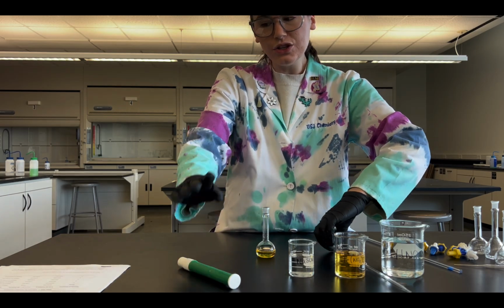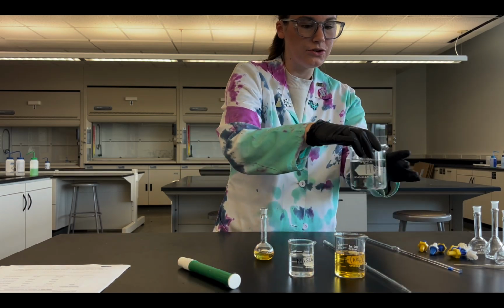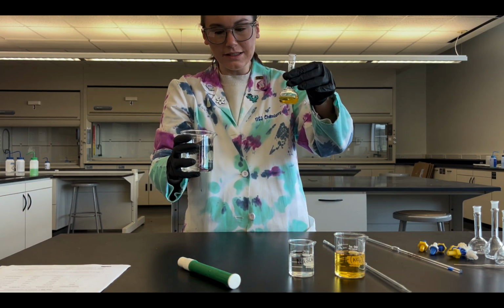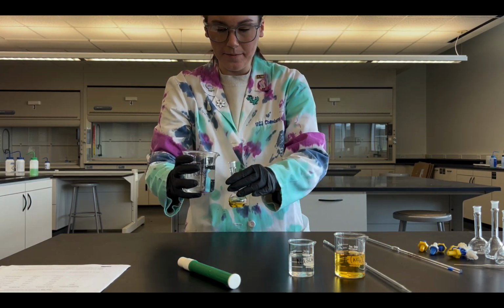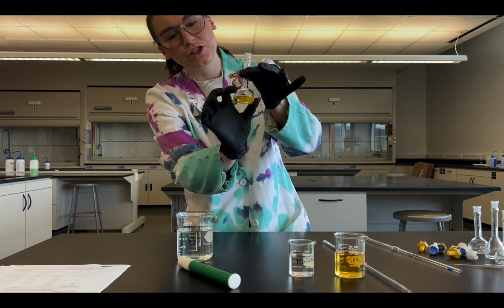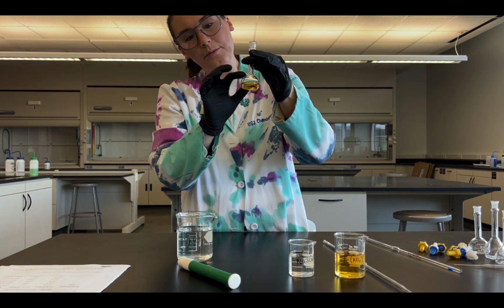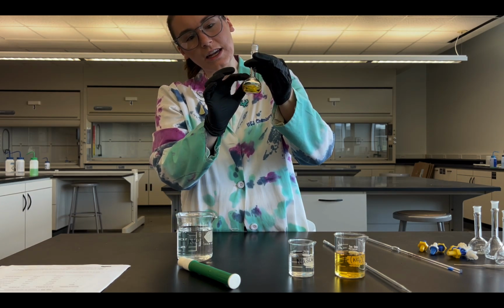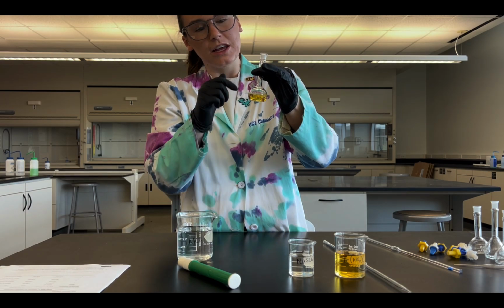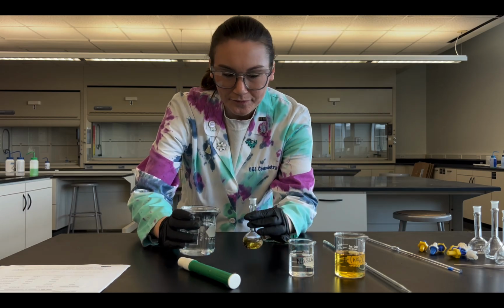Since the blank has none of the thiocyanate in there, what I'm gonna do is use my nitric acid to pour into my flask in order to dilute it the rest of the way. Now with a volumetric flask, once I get to the neck portion of it, it fills up pretty quickly. So I'm gonna fill the rest of the way up with my nitric acid, probably right until I get to the neck of my volumetric flask, and then I'm gonna use a pipette to do the rest of the way so I get my meniscus perfectly at that line.